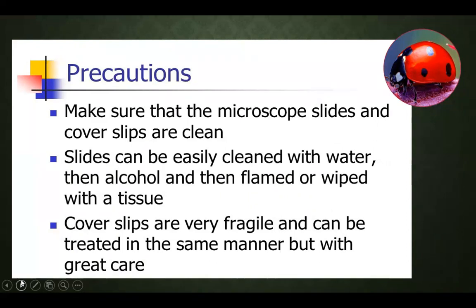they have very sharp edges. So while handling the cover slip, it is important that you use forceps. Avoid direct touch of the cover slip, because touching also affects the texture, as your fingerprints get onto the cover slip. That also causes difficulty in visualizing your image. And more importantly, the cover slip might break, so it can cause a small cut on your skin. To avoid that, it is better to use the forceps.